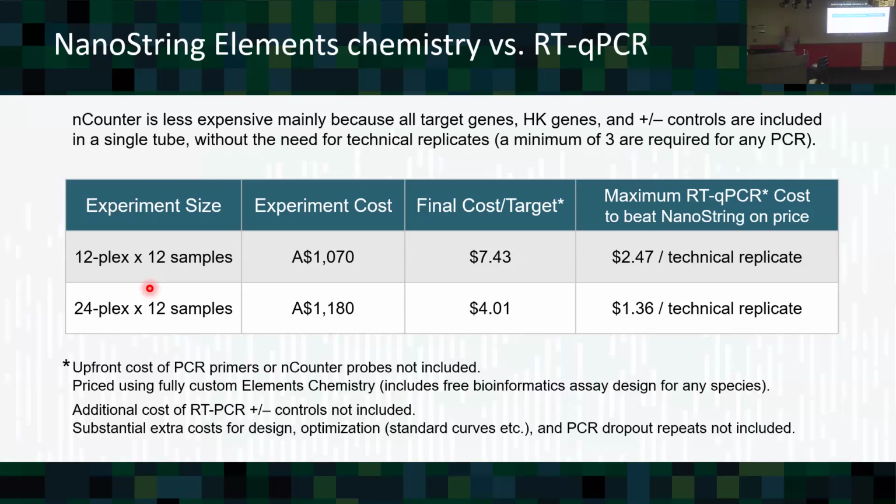Or you can go in and say, I've got a problem. I've got these two bacterial species and I wanted to separate them. Can you design an assay that will separate them? And they'll go through and design an assay to do that. And then they'll report it back. So they've done all the design work in separating out a target set that would work, and they'll give it to you.